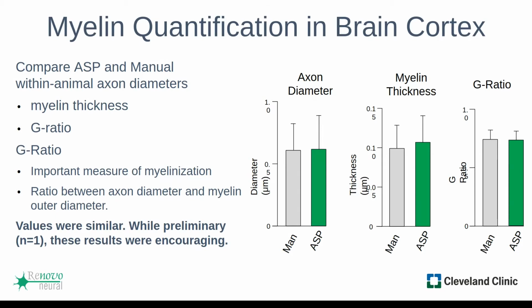So with all these examples, what we wanted to illustrate was that the staining was consistent, it had good contrast, and it didn't affect the tissue negatively or in a way that would render early data unusable, which had been a major deal breaker for us. And as I mentioned in an earlier slide, having good consistent staining opens the doors to easier auto segmentation and to AI and deep learning approaches that are used pretty regularly now.